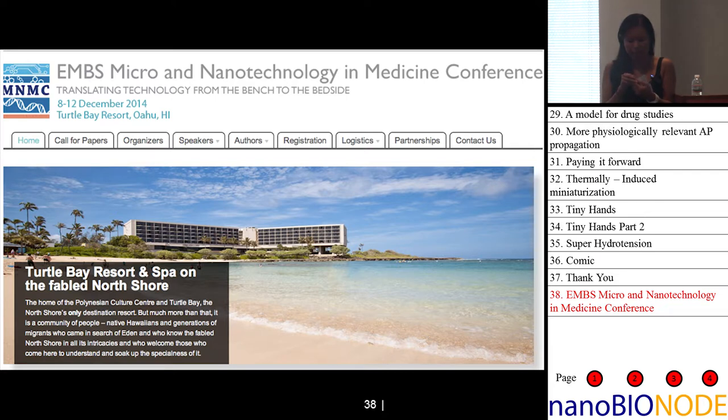We started making our own films, but we haven't really pursued that very much because it's much easier to just buy them. So you can see how thin the film is. So this is the shrink film. And that's just the adhesive that we back it onto so we can handle it more easily.